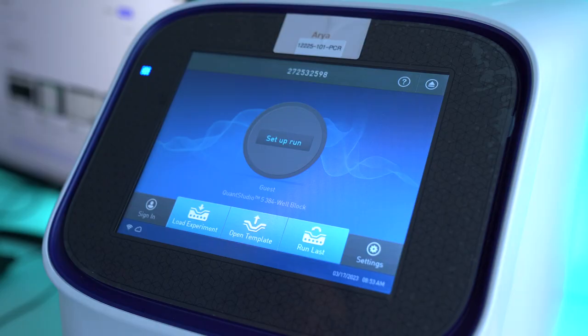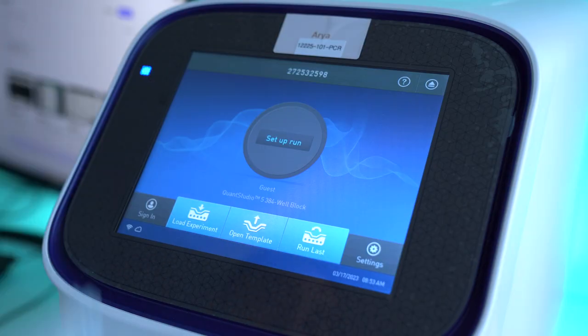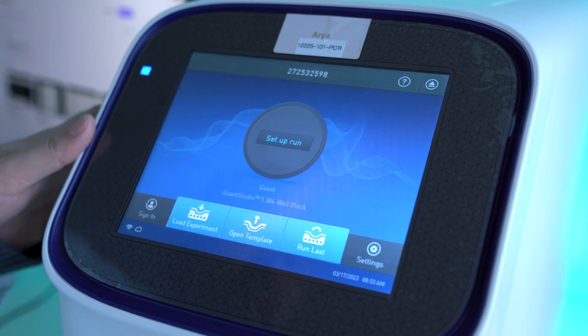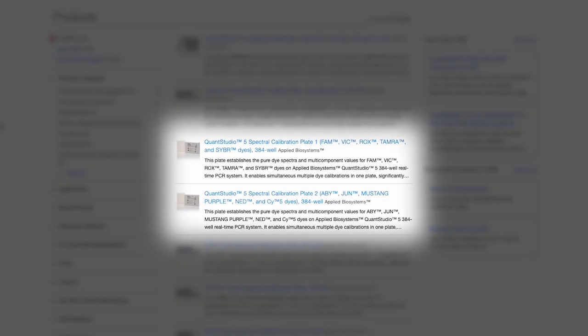What you're going to do is buy a couple of calibration plates for the QuantStudio 5. There are two kinds. If you buy a QuantStudio 12, you can buy plates that just have one dye on them. But for the QuantStudio 5, they sell two plates, and each plate has a mixture of dyes. These are the only two plates you can use to calibrate this unit.